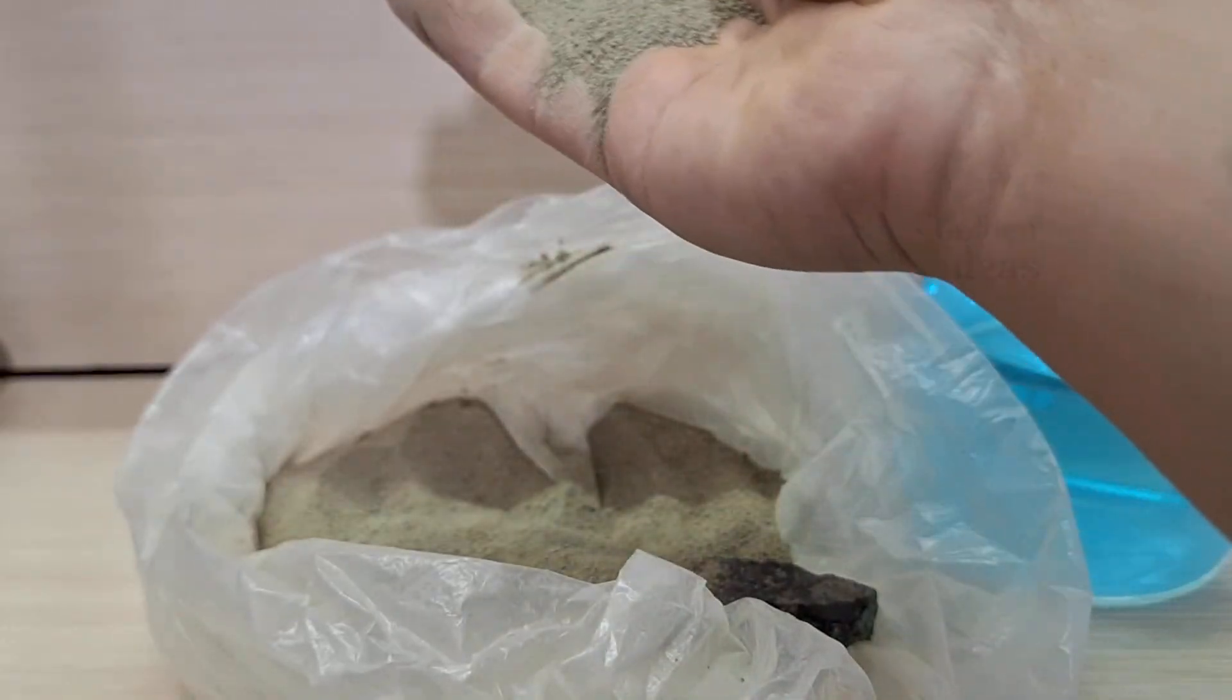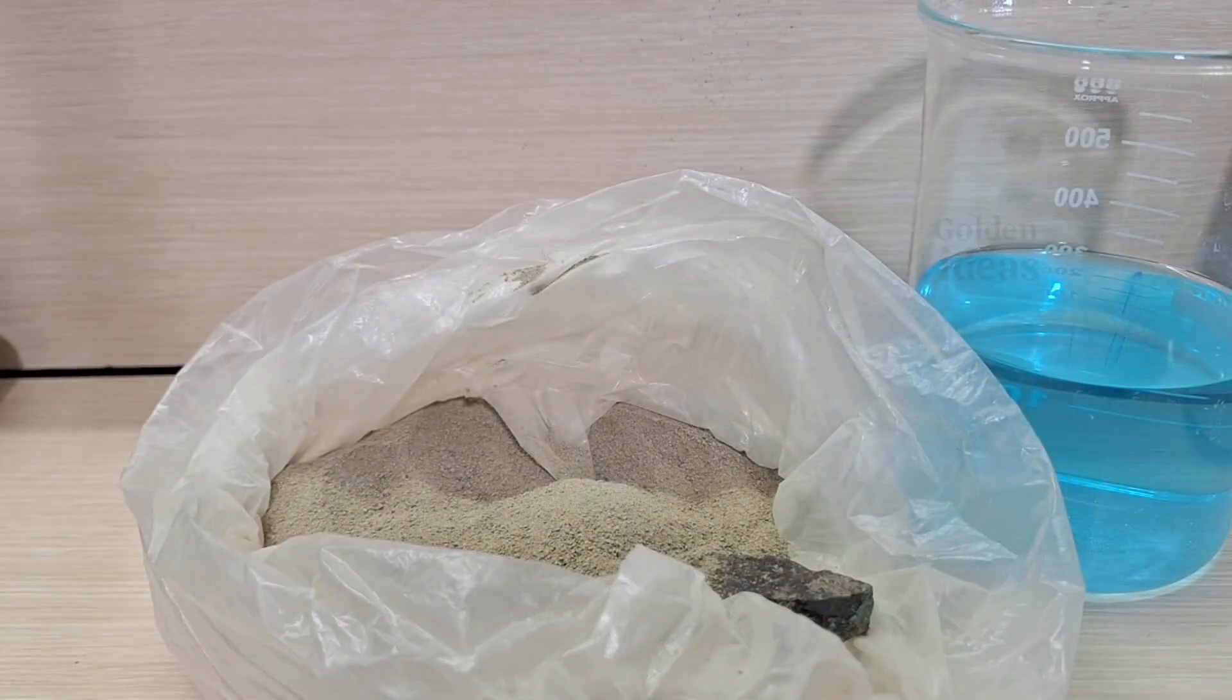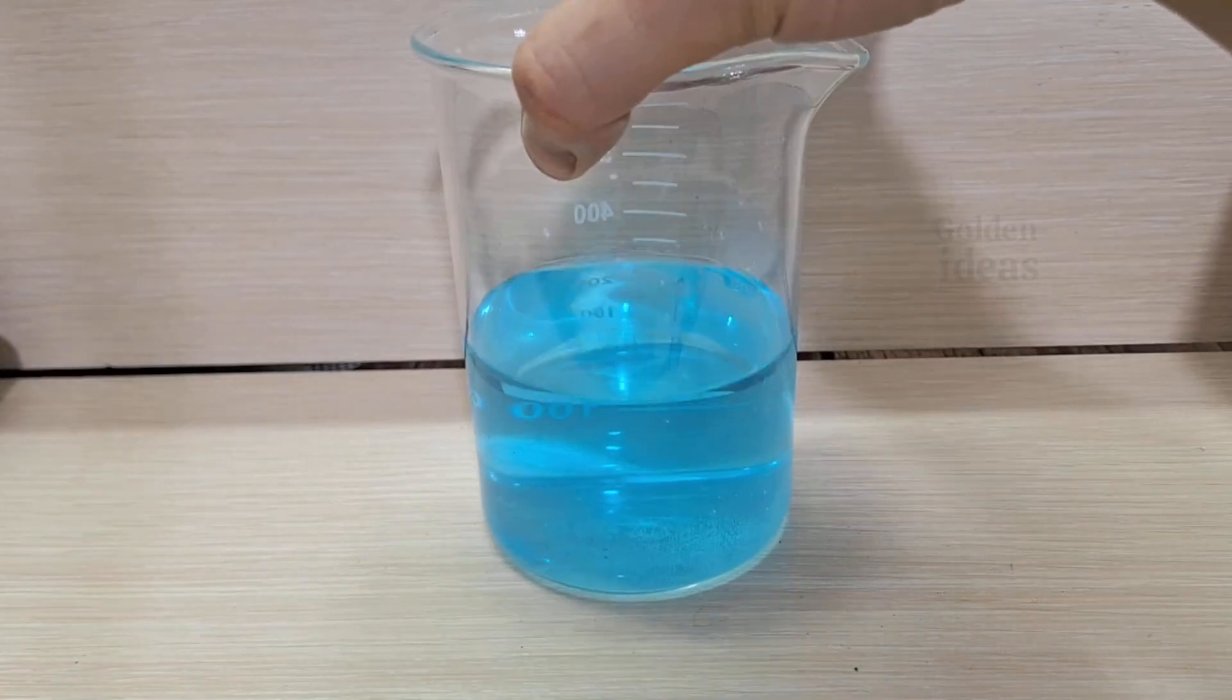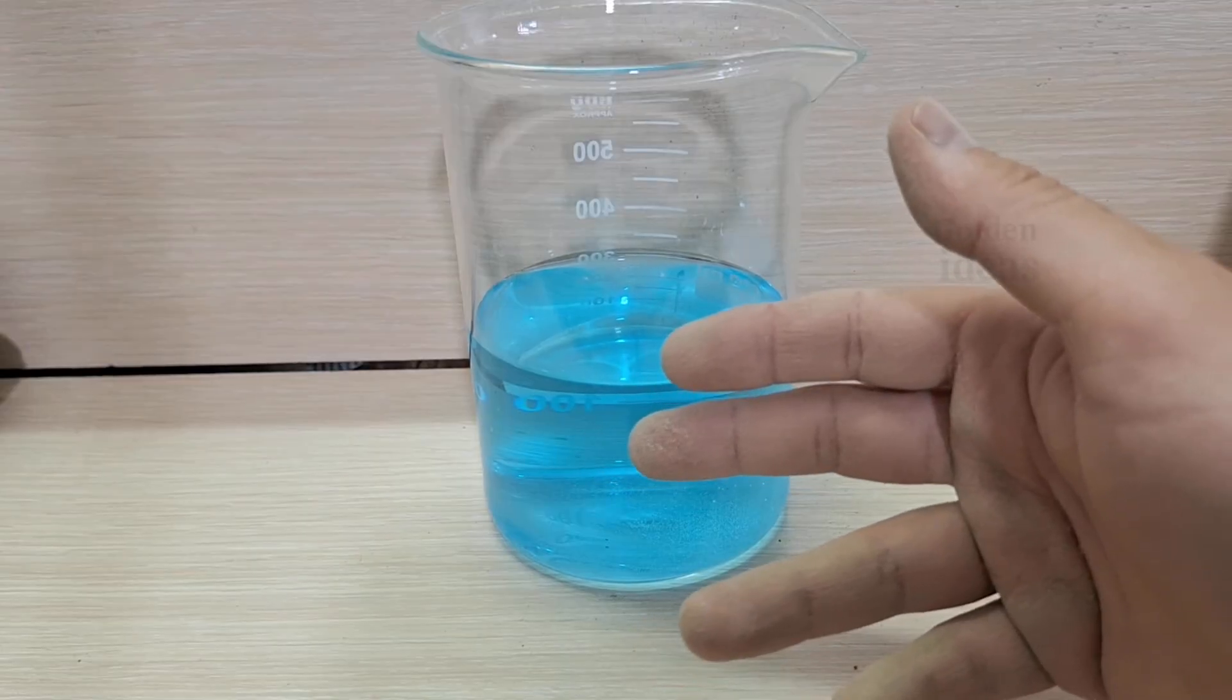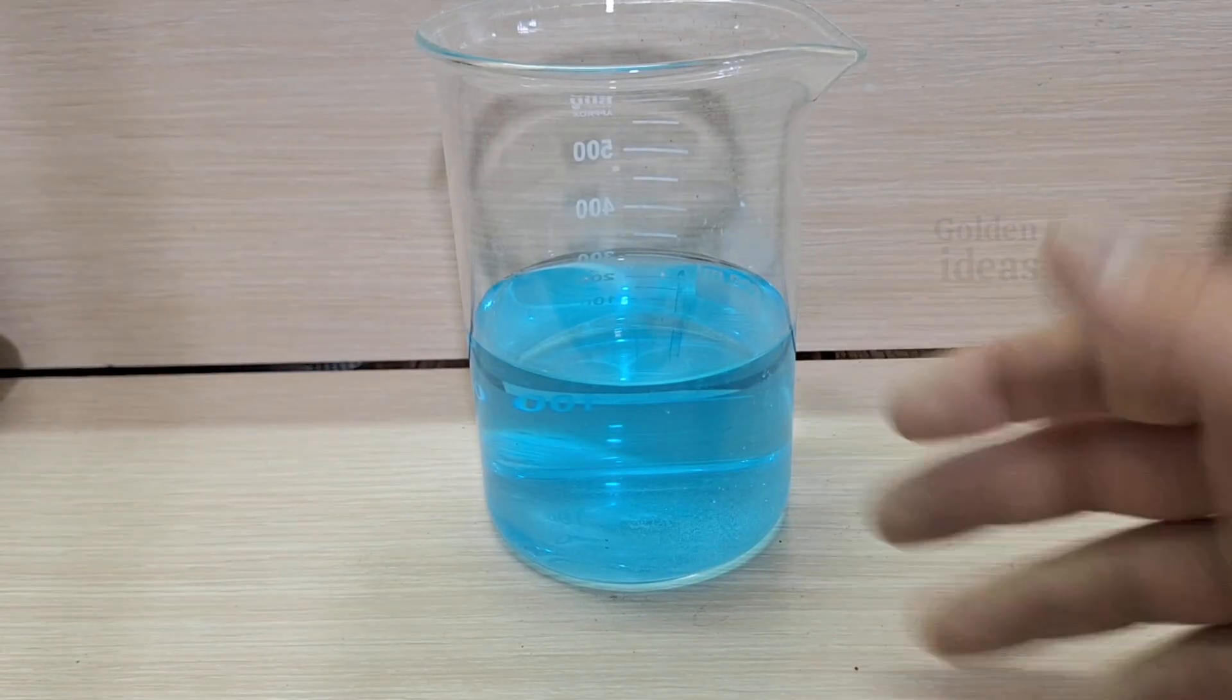This blue solution is the chloride extract obtained from this rock. This blue chloride solution contains gold, silver, and copper. To prepare it, simply dissolve the powdered rock in aqua regia and place it in a warm environment, like under direct sunlight. The heat helps the metals dissolve more effectively.